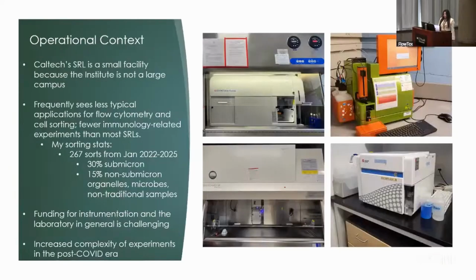All right, so here's some of the operational context. Many aspects in the facility that I was in, Caltech, are common to other SRLs, but a few things here are different. Caltech has a BD FACSAria Fusion and a Sony SY3200, plus 2 analyzers, one of them being the CytoFLEX S and the other a Miltenyi MACSQuant VYB, and they're pictured here. Sheath fluid is entirely made in-house, so that's no surfactants and no preservatives. The only one that we don't do it in-house for is the VYB.